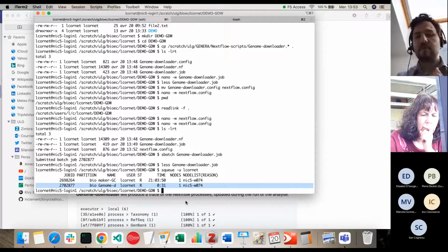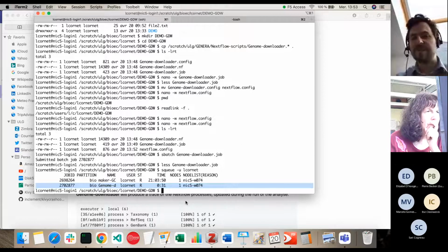So now you understand more why I'm explaining what is a process, what is a channel, what are Singularity containers, and how to use nano. Maybe it makes sense. I hope so. With this way, you can launch all the tools. It's always the same.